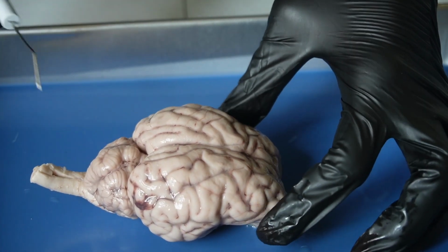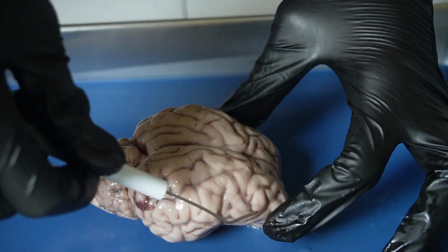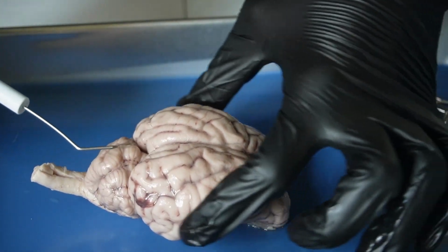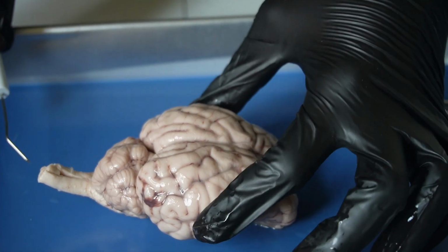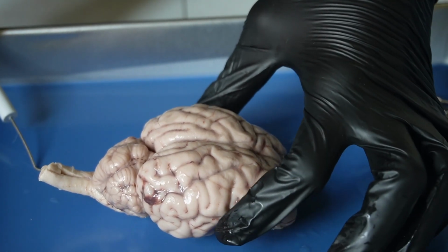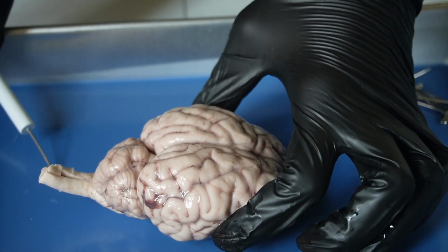And then next would be the temporal lobe, which would be proximal to the frontal lobe and inferior to the parietal lobe. It is on both sides of our temples, hence the name temporal lobe. The temporal lobe facilitates audio and language processing, as well as it is the area that also deals with memory.